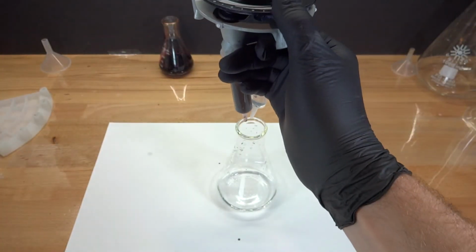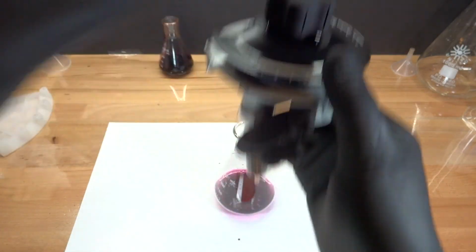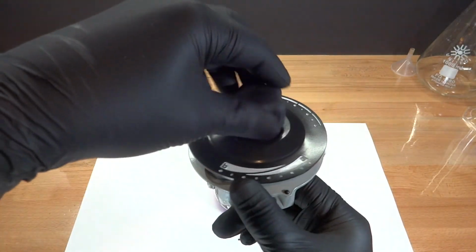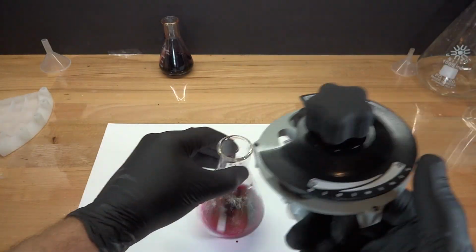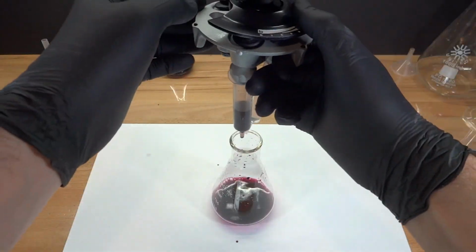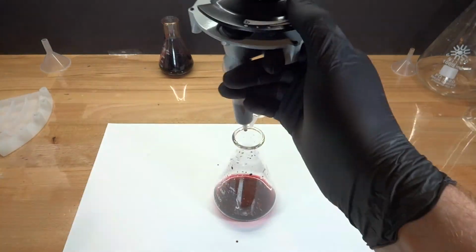Here we present the third titration at double the normal speed. A good understanding of technique, the properties of the reagents, and the tool set demystifies this procedure. Is it possible that a new tool will make titrations go this smoothly? Seriously though, let us take a minute or two to remind you of lab safety.